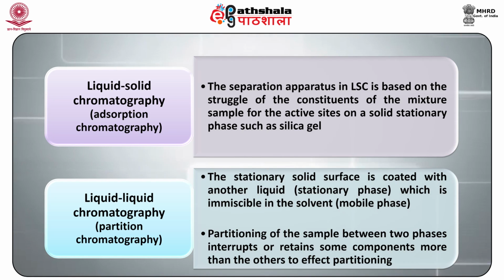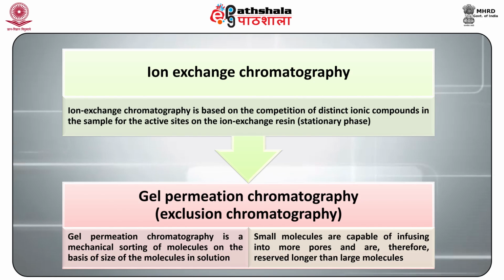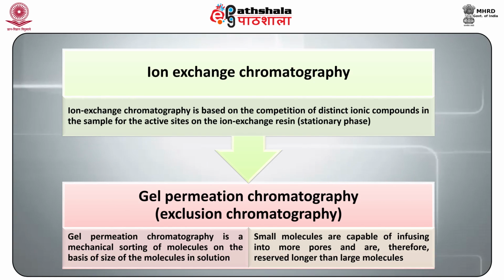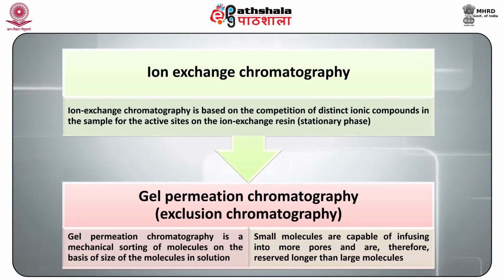Liquid-liquid chromatography, termed partition chromatography. The stationary solid surface is coated with another liquid stationary phase which is immiscible in the solvent, the mobile phase. Partitioning of the sample between the two phases retains some components more than the others. Ion exchange chromatography. Ion exchange chromatography is based on the competition of distinct ionic compounds in the sample for the active sites on the ion exchange resin, or the stationary phase.